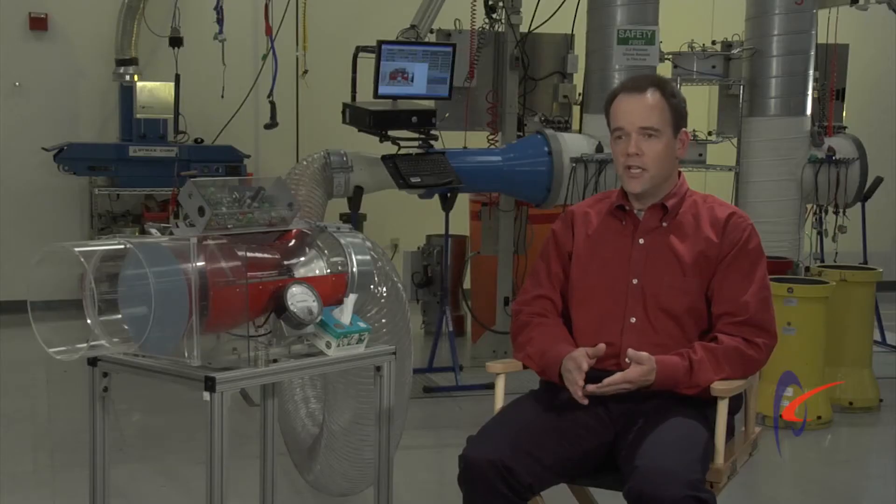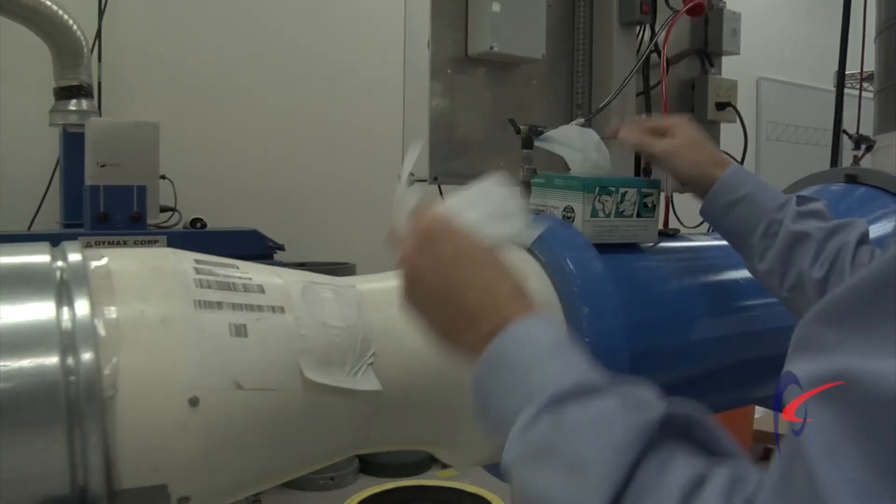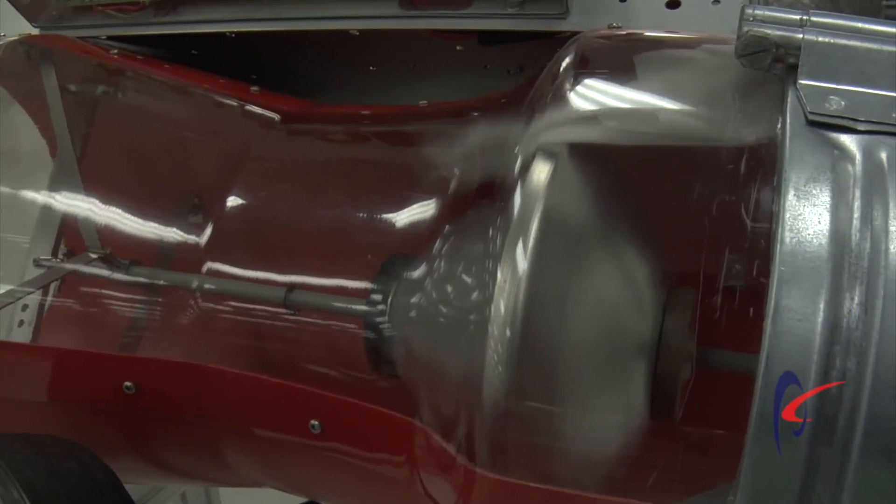Another important test we do during the red valve demo is inject lab tissues into the duct stream and watch them get stuck or flow straight through the Phoenix valve and how it has no impact on the accuracy of the Phoenix valve.